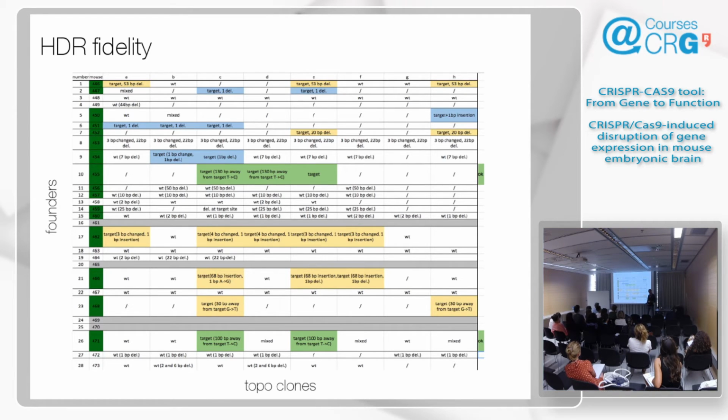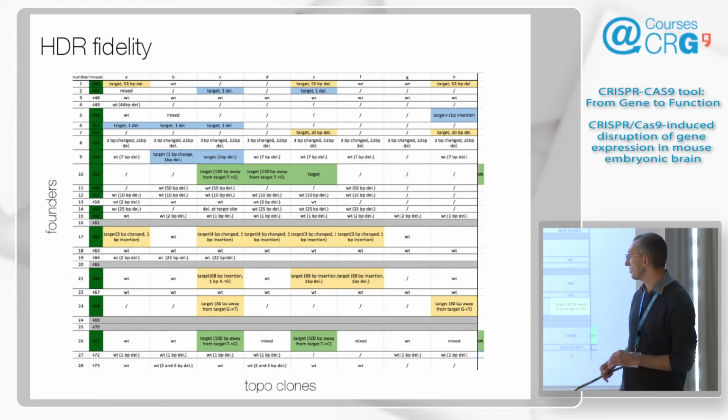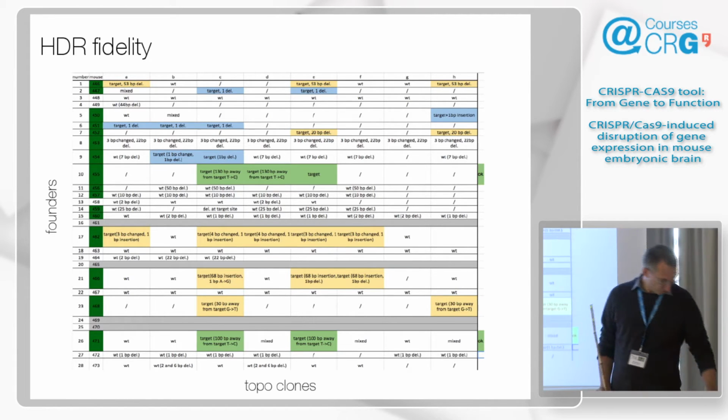But some of them happen probably through a different mechanism because they happen outside of the oligo region. So what we've seen in some cases is that you get homologous recombination on one of the arms, and then non-homologous, or homologous plus indel on the other side. So this is happening. So this first round, there were a lot of false positives, but at least you focus on the candidates, and then you identify them. Nevertheless, with 1 injection, multiple founders, unbelievably efficient.